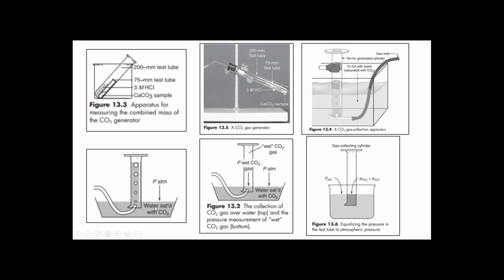So this is going through the water, and eventually you see this volume is being pushed down, until this is an exaggeration. I've never seen it like this. It's usually like this for most students, and then some of the students are really sad, because I'll explain to you why, when they have it up to here, it's not really good. When they have it up to here and the change of volume is not much, that makes this a lot harder. So it's usually up to here, but we consider this wet CO2 because it had to go through the water in order for this to be pushed out.